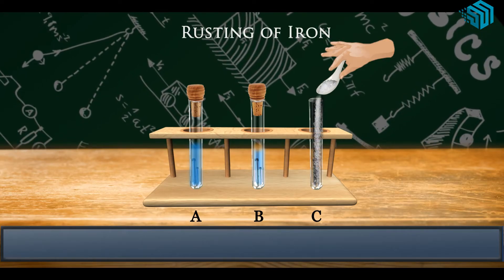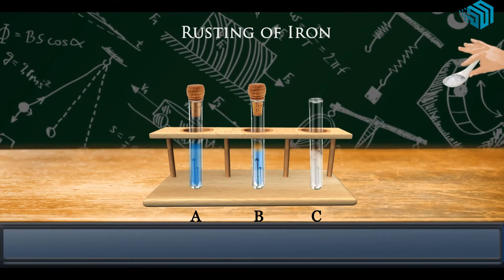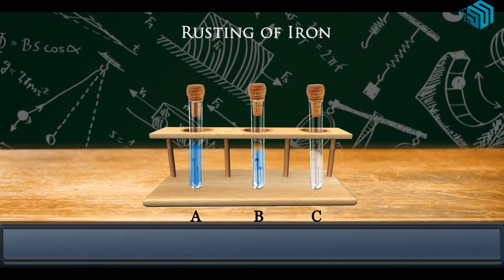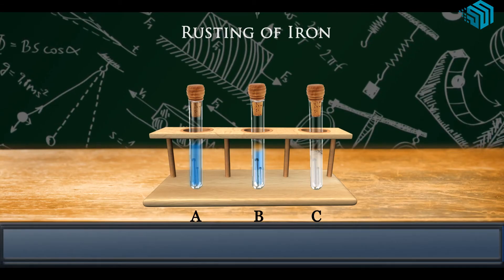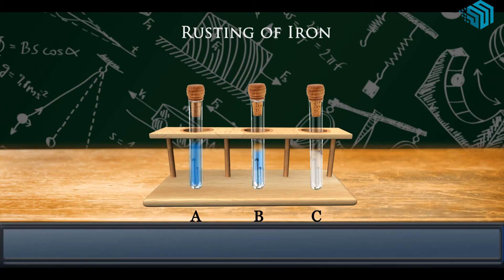Add anhydrous calcium chloride in test tube C and cork it. Anhydrous calcium chloride will absorb the moisture from the air present in the test tube.